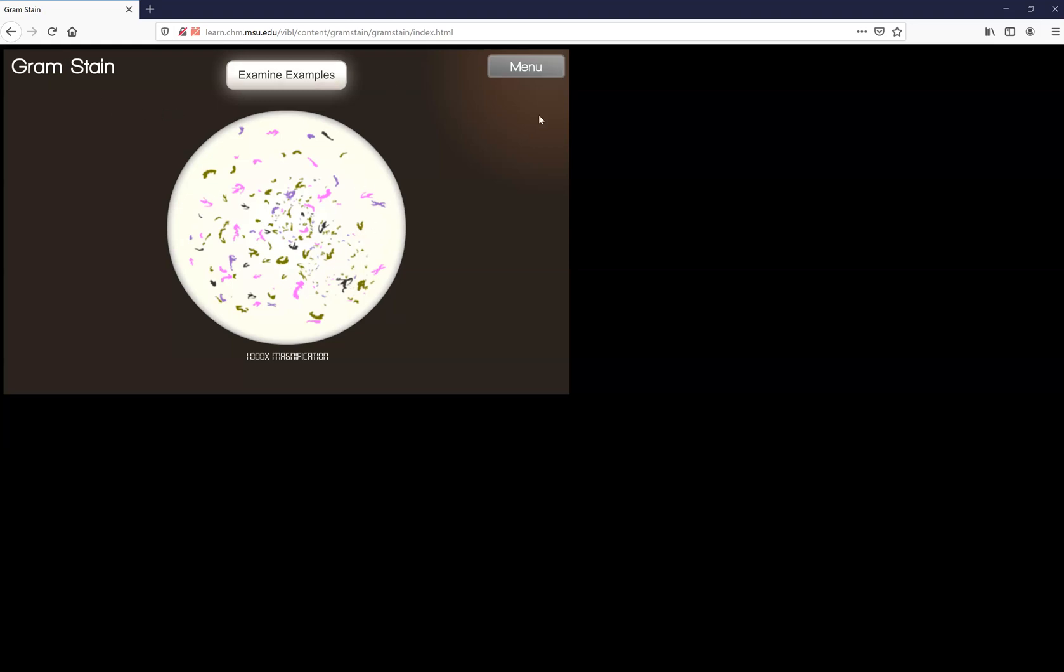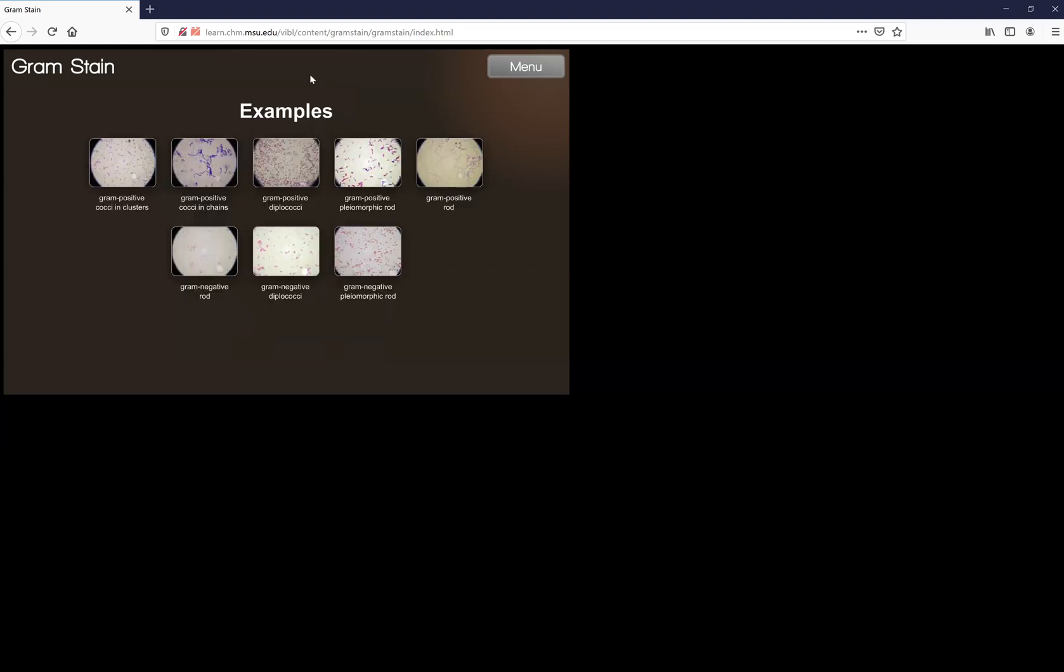Go ahead and take a screenshot of this using your snipping tool and paste that into your assignment. Do that before you click anything else or you're going to have to restart completely. You can examine examples and it shows you what different ones look like but once you click that you can't go back. So make sure you've screenshotted where it says to screenshot.